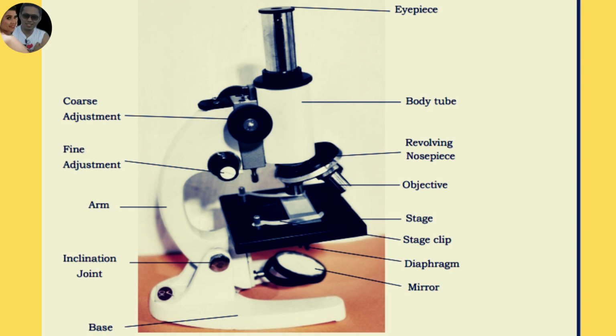A microscope is a tool that can help you see tiny objects and single-celled organisms. It makes them look bigger. Its ability to make the specimen bigger is called magnifying power or magnification. The microscope also has the capacity to distinguish small gaps between two separate points which humans cannot distinguish. It is called its resolving power or resolution.